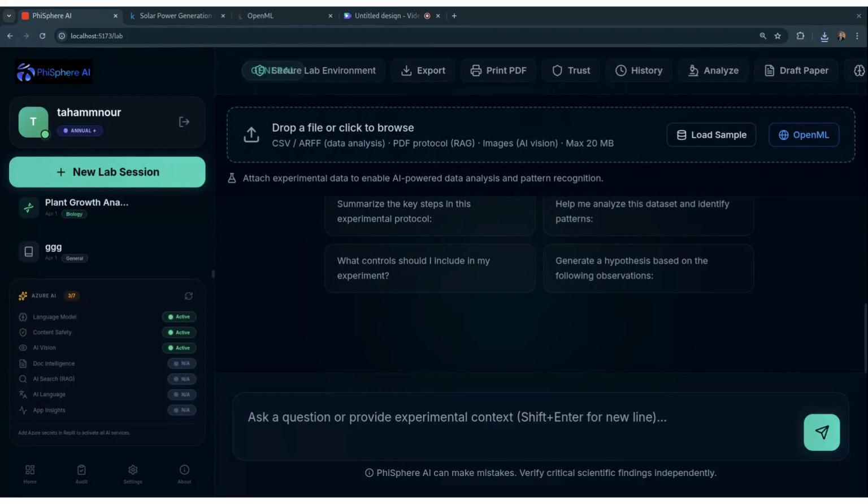This helps identify trends, stability, and any performance drops or improvements across different time windows. The line charts with statistical bands, mean plus standard deviation, provide deeper insight into normal versus abnormal behavior.